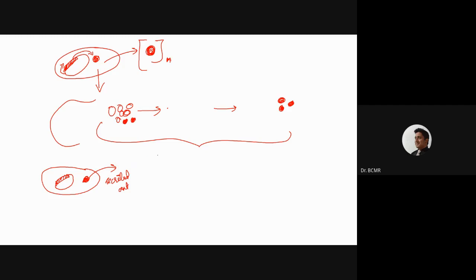All we need to do, if this is the situation, is grow the bacterium in continuous cultures, not necessarily batch cultures like we would want it here. In this case, it would be batch. You grow, take out the cells, and then isolate, I mean, purify the protein.